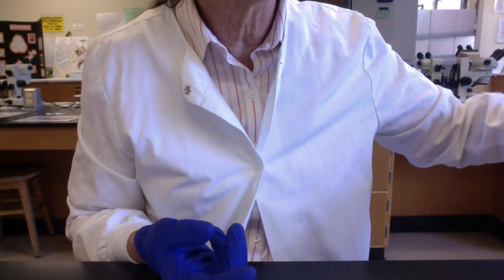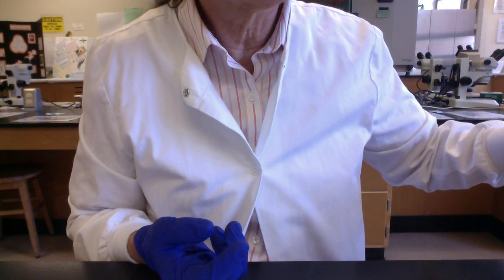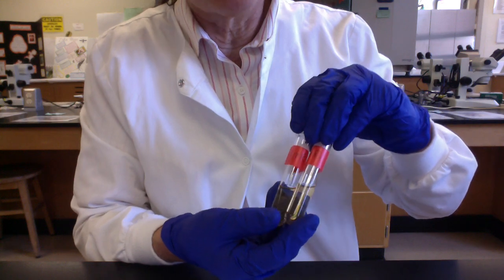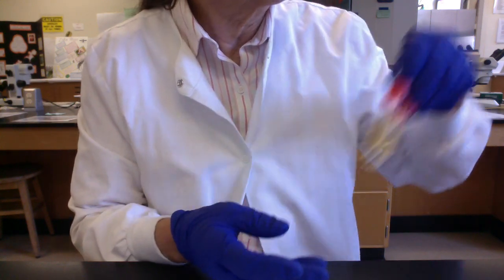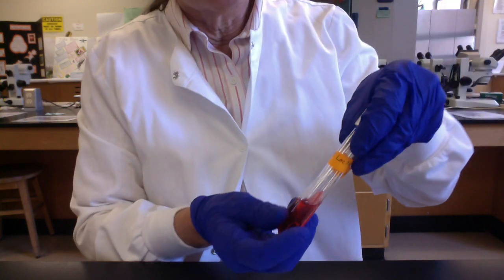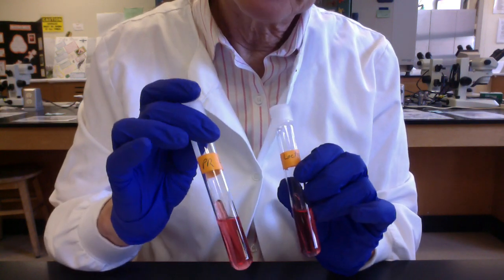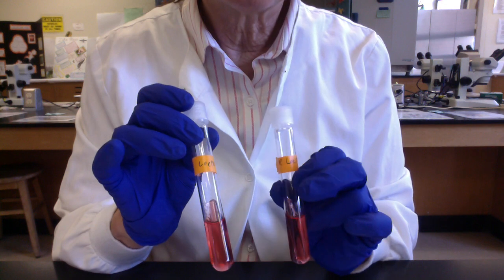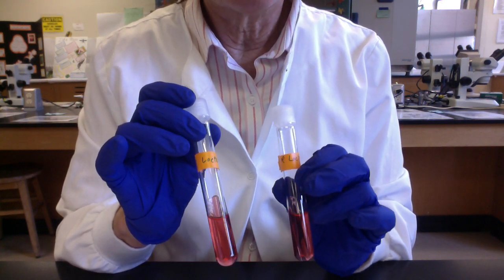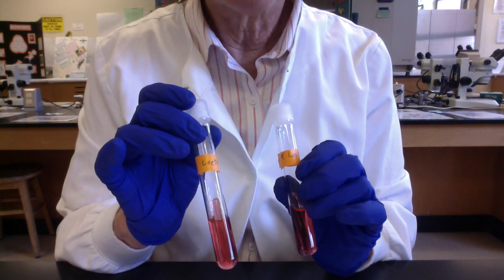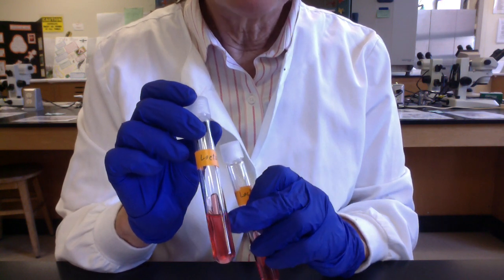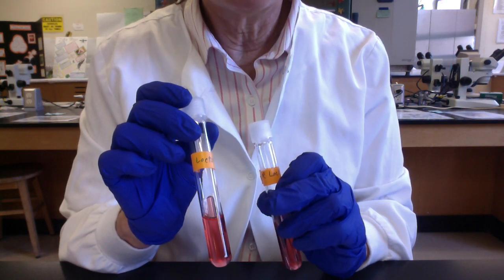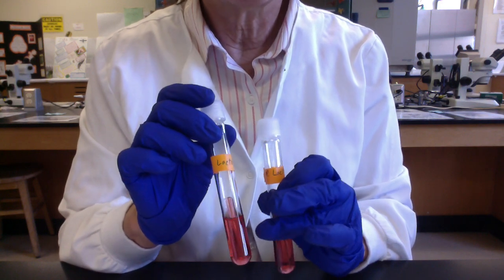One thing we'll see in later lab manual chapters when we start doing biochemical or metabolic tests, we can include different ingredients in our media. For example, in chapter 17, we'll be working with methyl red broth to test for mixed acid fermentation. In chapter 16, we'll be testing the ability of our microbes to ferment different sugars. For example, this is PR lactose, which means phenol red lactose. PR stands for the pH indicator, phenol red. Lactose is the only sugar present. If we inoculate our microbes into the PR lactose, if they can ferment lactose, they'll make acids. That'll drop the pH. And the pH indicator, phenol red, which is giving this broth a red color, will turn yellow at acidic pH. That's how we're going to determine that our microbes could ferment lactose. More on this in chapter 16 in our lab manual.